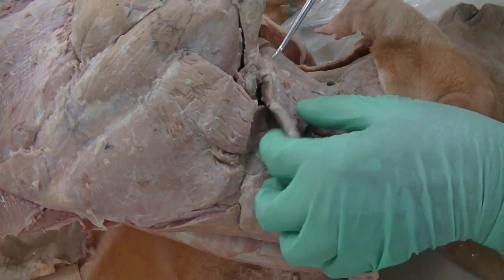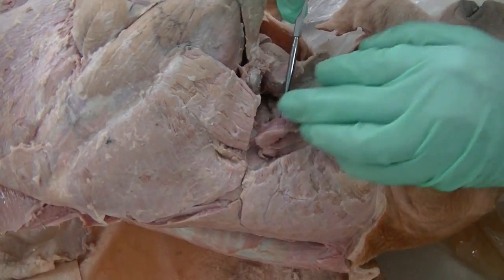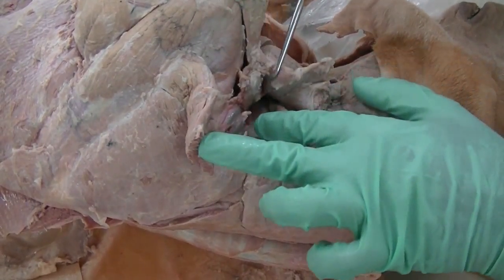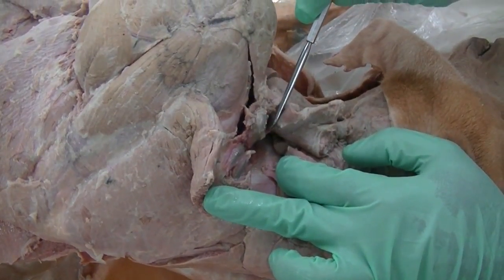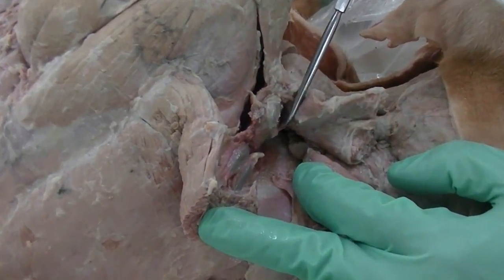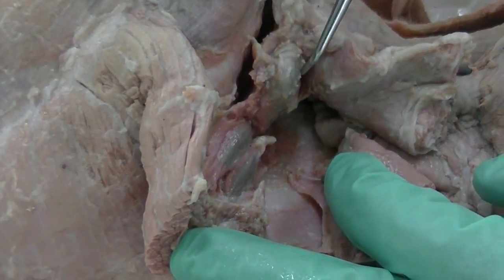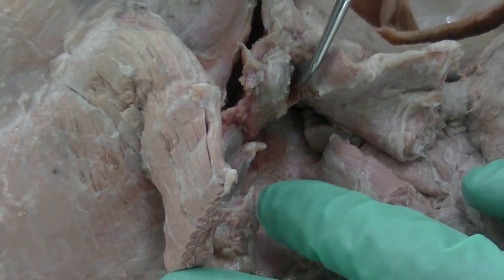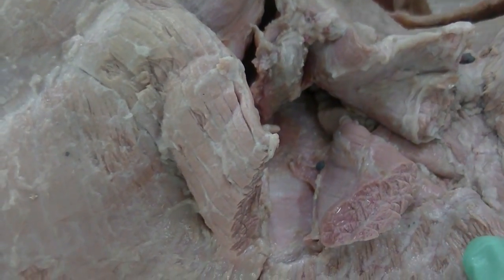brachiocephalicus and expose the omotransversaris muscle. After transecting the omotransversaris, you will also find the superficial cervical lymph nodes, which are located in this region. The superficial cervical lymph nodes, also known as prescapular lymph nodes, are responsible for draining the head, neck, and the entire forelimb.